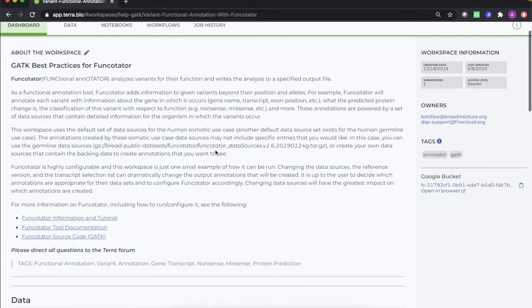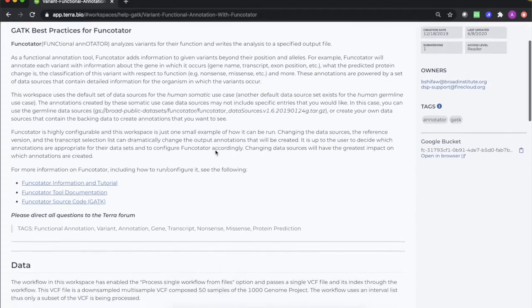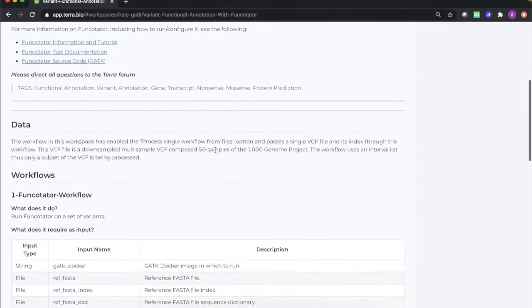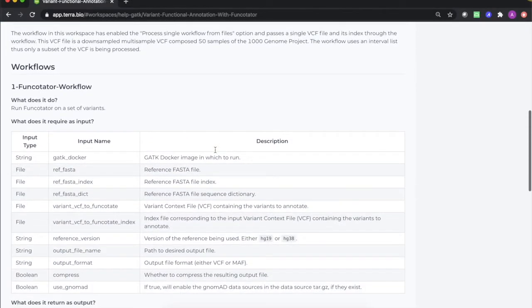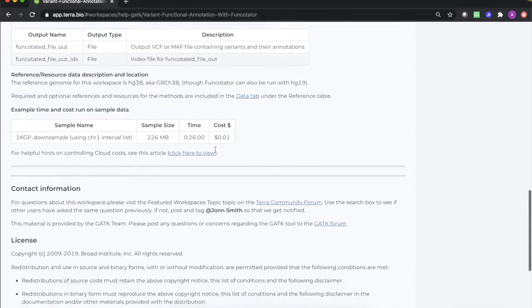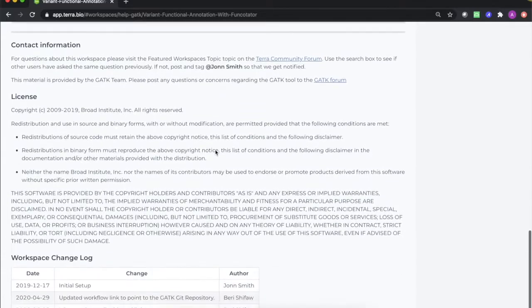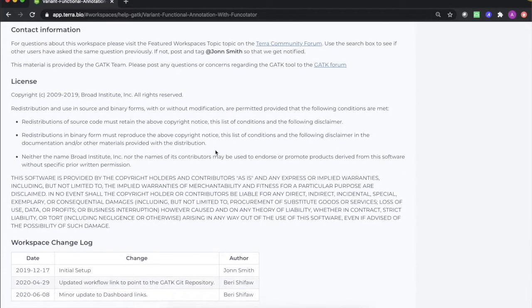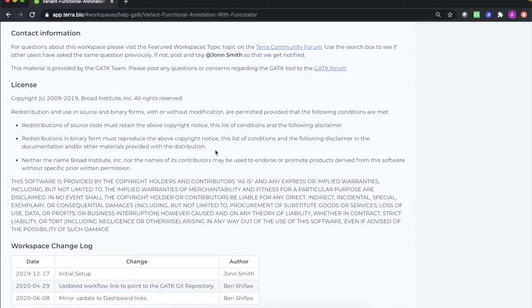Funkotator is highly configurable, and this workspace is just one small example of how it can be run. The dashboard contains links to a wealth of information about how to reconfigure it.